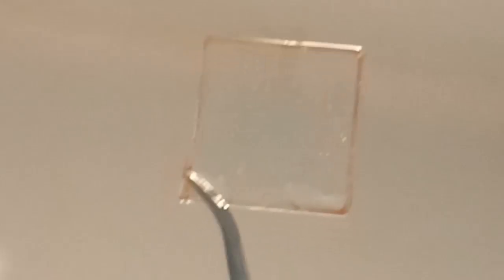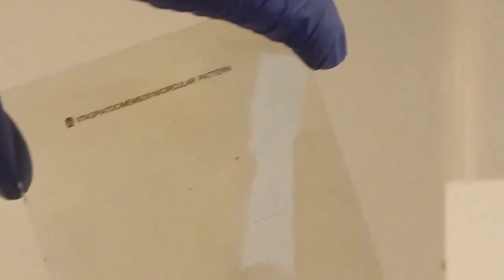It is visible with the microscope, right? Yes, it is visible with the microscope. You can also observe at the corner that the photoresist is still not completely washed off. Now you can see the structure using the camera. The photomask structure has been replicated here in the photoresist. You can see these circular structures, the structures of the photomask, on the microscope.